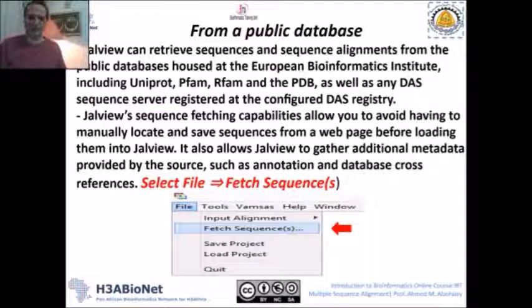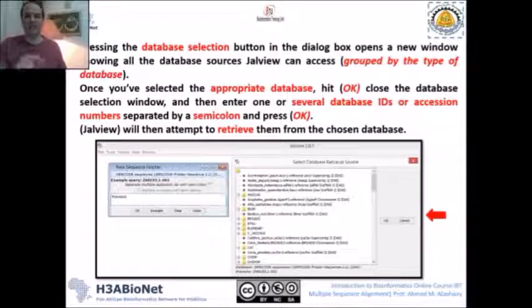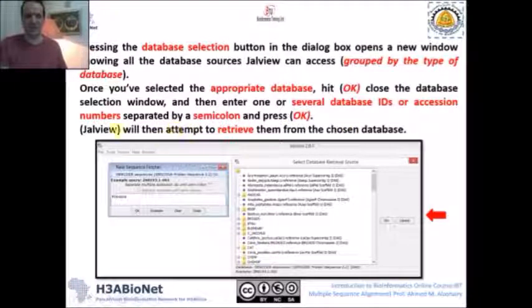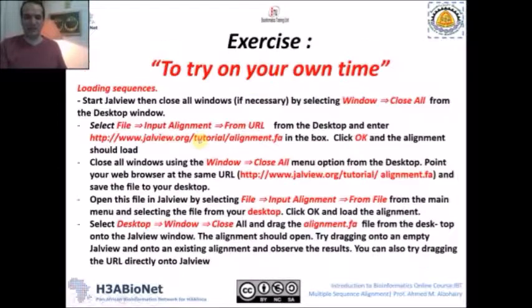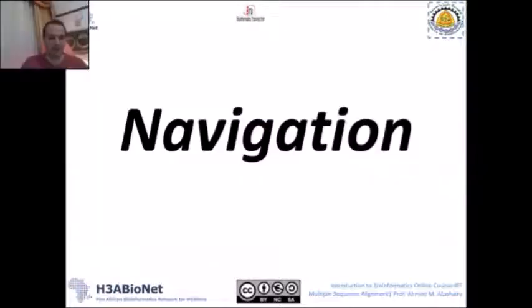Another option is Fetch Sequences. When you press this option, a dialog appears that allows you to enter the accession numbers of your sequences, separated by semicolons. Then select the proper database you would like to retrieve them from and press OK to retrieve. In your own time, try to exercise this — put in the accession numbers from your exercise and try to retrieve sequences from different databases.